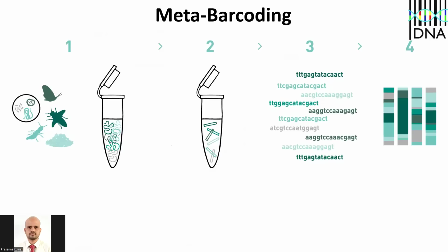So far you have seen what barcoding is, how the barcoding database is built, and how anyone, anytime, even a non-taxonomist, can sample any specimen and identify it using barcoding. Now I want to slowly introduce you to something called metabarcoding. What is this metabarcoding? This is community barcoding, meaning you don't need an individual sample. You can have a group of samples, grind it, extract DNA, go for PCR. Every biological entity in that group can be decoded by sequencing, and you can identify them to species level. This is community barcoding, or metabarcoding.